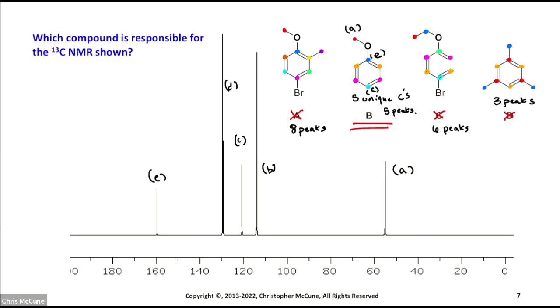And so there's 2 carbons giving rise to one of these peaks. That's a singlet instead of just one. And so you can see the peak height ratio being influenced by that. And so I believe here this is going to be B, and this will be D, respectively. So that's how you can kind of use the carbon NMR to help you decide what structure you may or may not have.